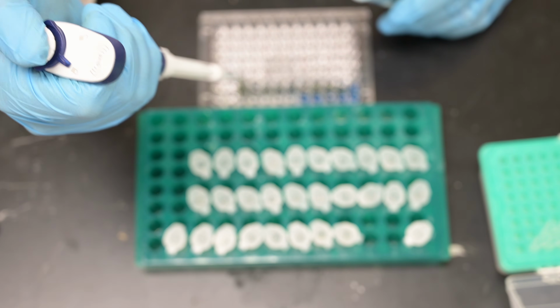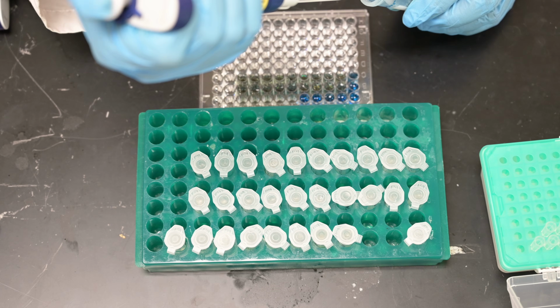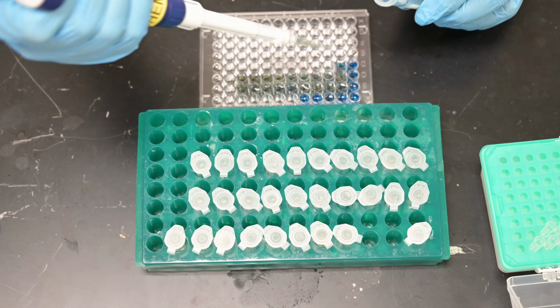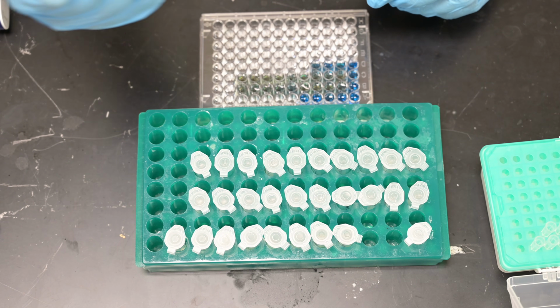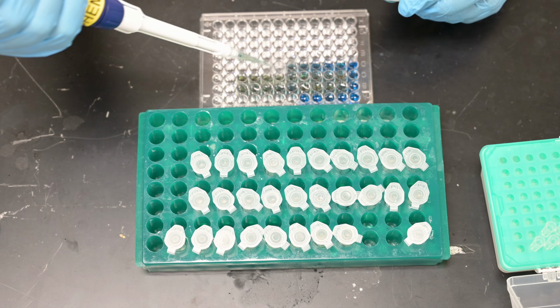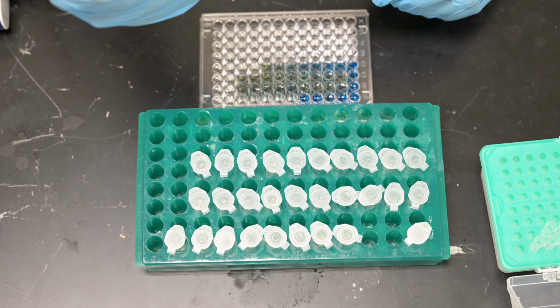And I'll just go ahead and go back this way. Now I'll add the reagent to all the standards. Notice how quickly the reaction occurs? That's the one really nice benefit to this method. We go to number 8, which is here.